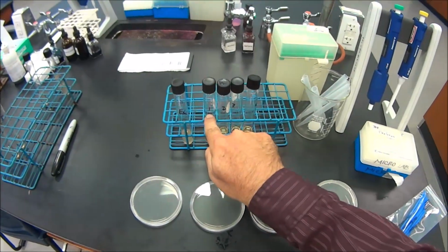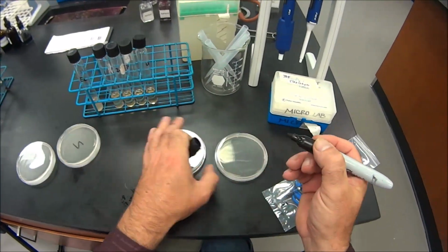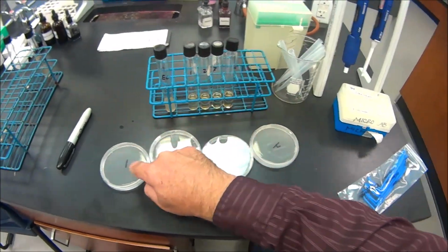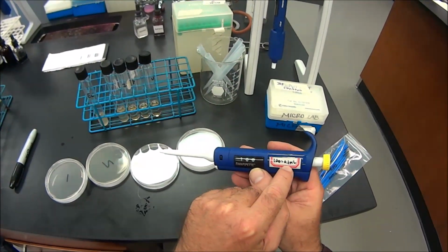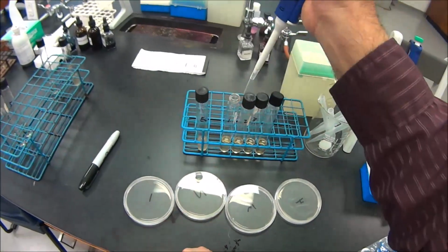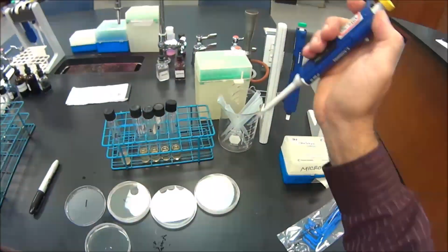Okay, now that we have our dilutions 1, 2, 3, and 4, we're going to put them on these petri plates. So I'm going to call this 1, 2, 3, and 4. Just make sure we don't get the lids confused with each other. So now we're going to put 0.1 milliliters on the petri plate. So we use the pipette set at 100 microliters, which is 0.1 milliliters. We put a sterile tip on, take a sample from tube number 1, and open up the lid and squeeze it on there.